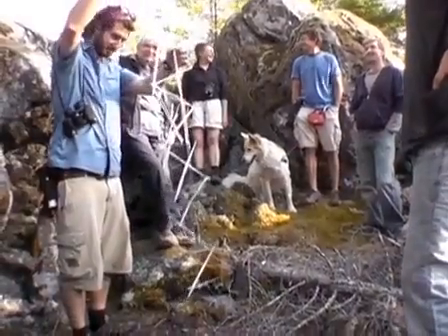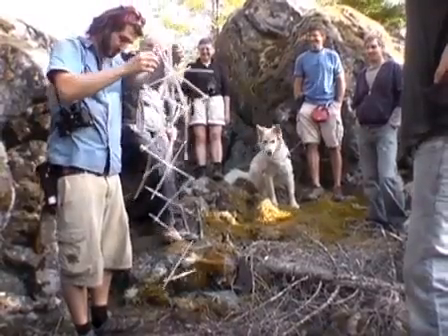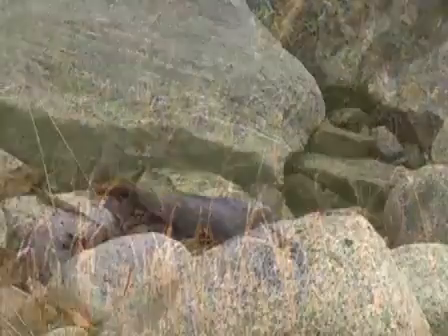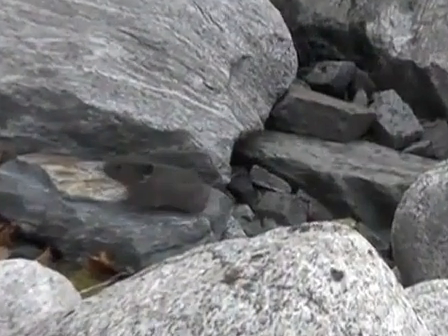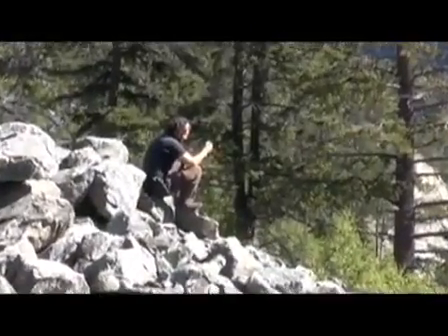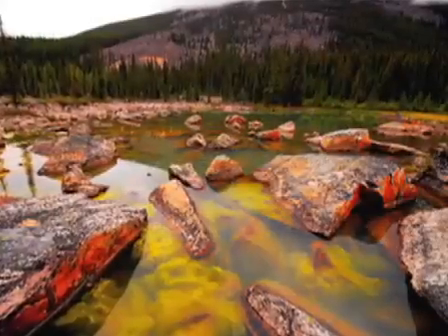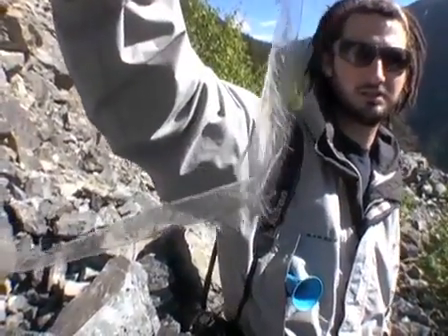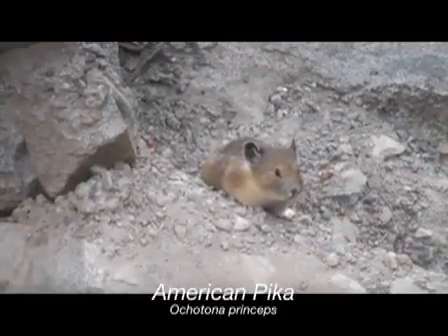While these techniques have mainly been applied to medium-sized to large carnivores such as grizzly bears, less effort has been focused on smaller herbivorous mammals. To bridge this gap, novel, innovative approaches to sample small mammals are being developed. This video article describes a new and innovative way to unobtrusively obtain hair samples from small lagomorphs called American pikas.